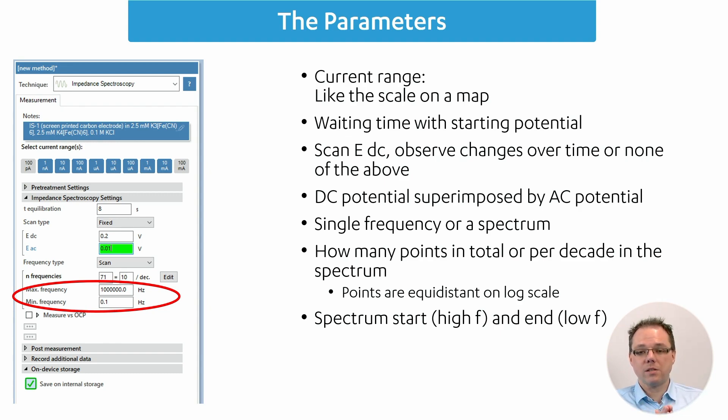Then you can set the boundaries for your impedance spectrum. You can say which one is the starting frequency, which is usually the high frequency, and where it ends, which is the low frequency. Impedance spectra are recorded traditionally in a dispersive way, meaning you record a frequency, get your values, switch to the next frequency, record the values, and so on. High frequencies will very quickly give you a measurement point, where low frequencies will take a long time. So traditionally we start at high frequencies and end at low frequencies.